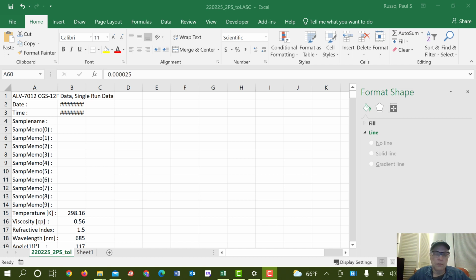Hello. We're going to make a little video here that shows visual analysis of some dynamic light scattering DLS data. I have two purposes. One is to demonstrate kind of how we do this for fitting multiple exponentials using solver. For that purpose, maybe later we'll do one with a grid search as well, but that would be a separate video.